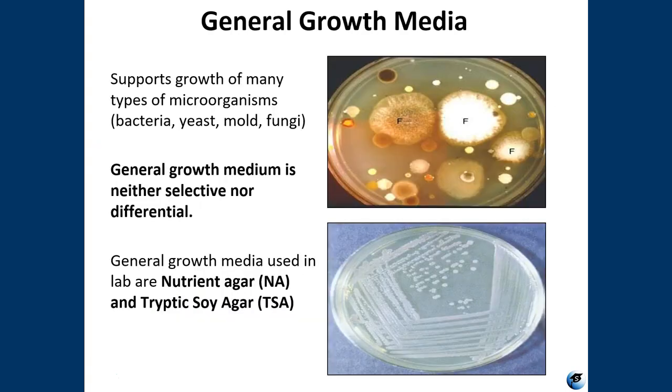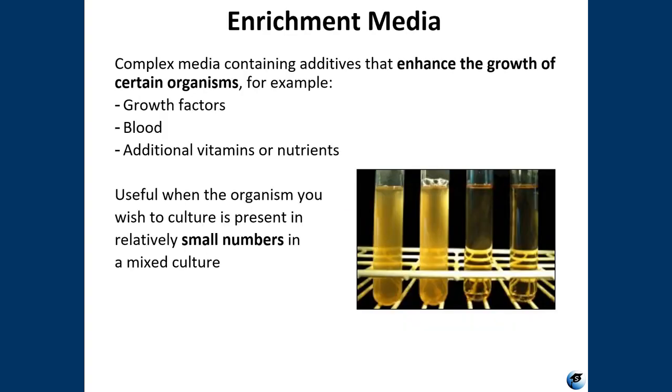Let's talk first about general growth media. This is going to be neither selective nor differential. And what that means is basically if something can grow in the lab, because some things don't, it should be able to grow on general growth media. The ones that we commonly use in our lab are nutrient agar, tryptic soy agar, and tryptic soy broth.